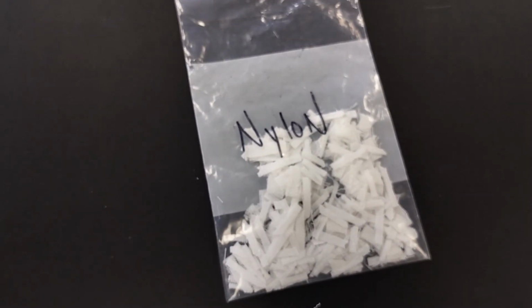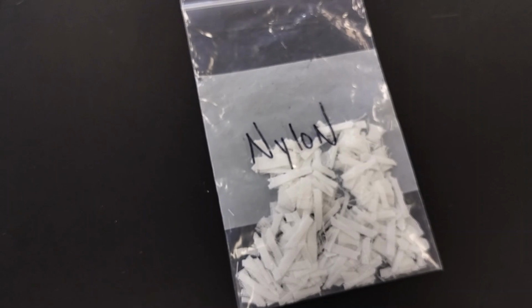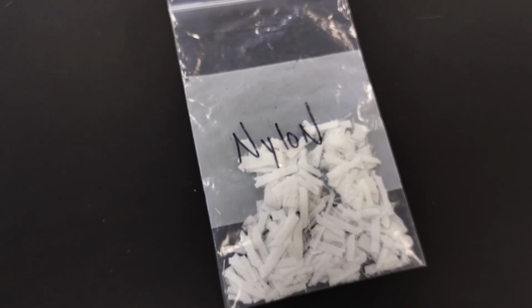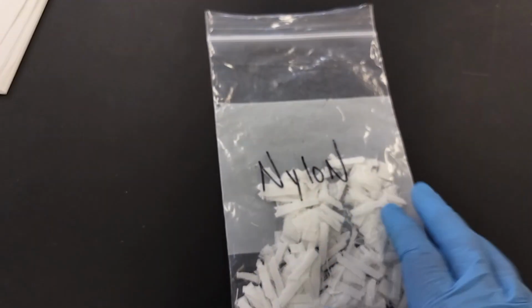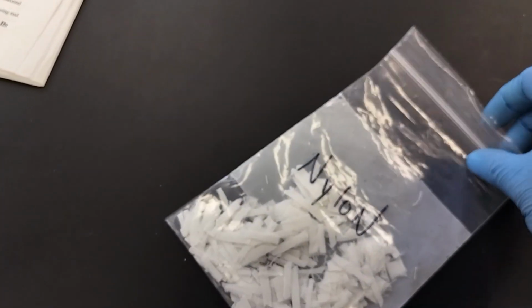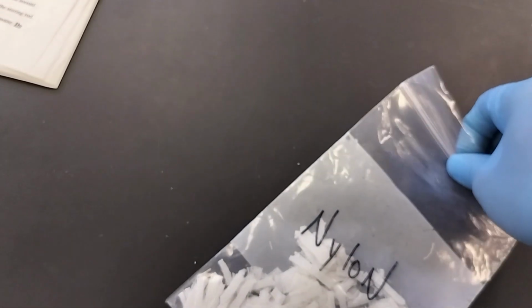So to identify it correctly, we will follow the testing order, like first acetone, then hydrochloric acid, and finally nitric acid. Then we will observe the result. Then based on the results, we will conclude the fiber name.